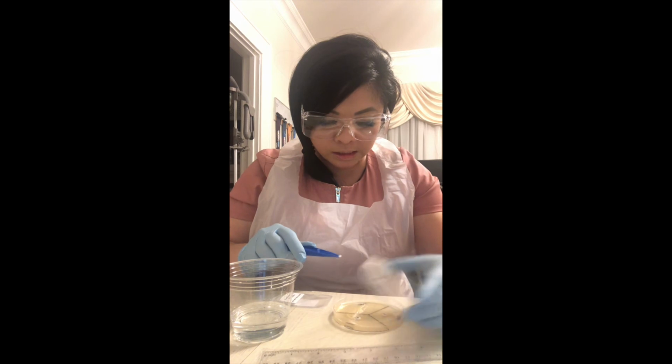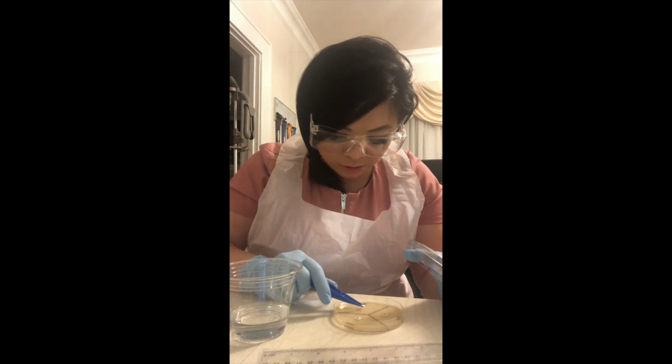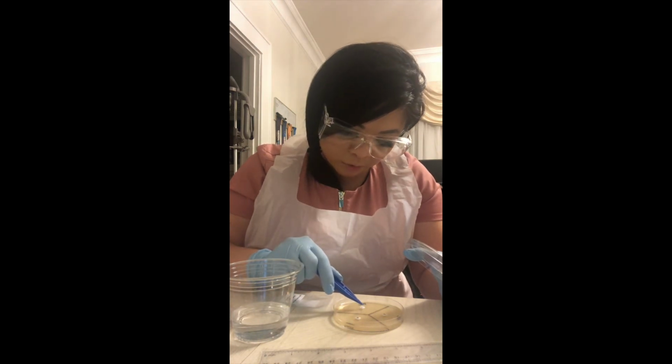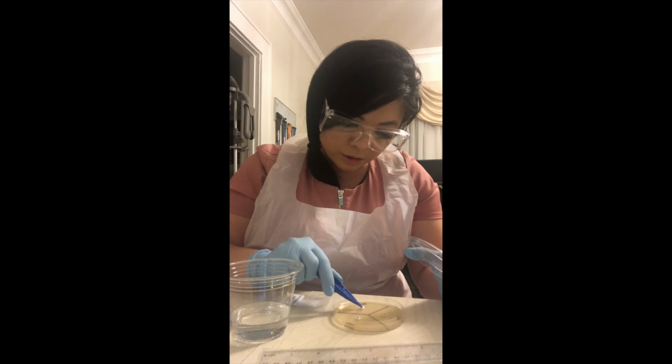So now with the disc, I'm going to transfer it to the plate. I'm going to place the disc on the plate in the section that is labeled PNC, penicillin. Then gently with the tweezers, press it down a little bit with a little bit of pressure into the agar so it is secure.